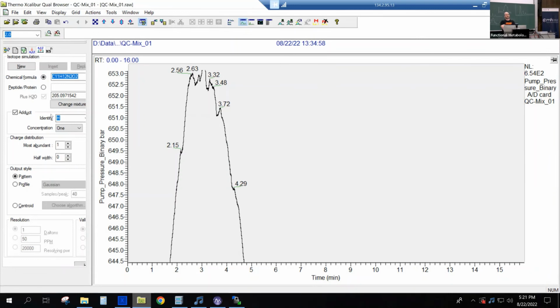Oh, we always like both pumps to run a little bit, right? Because we have a binary pump, so it's a high pressure gradient system. One pump pumps only water, the other one pumps only acetonitrile. If I would go to 100 and one would stop... So it's a common thing that you always maintain them at that low flow rate at least.